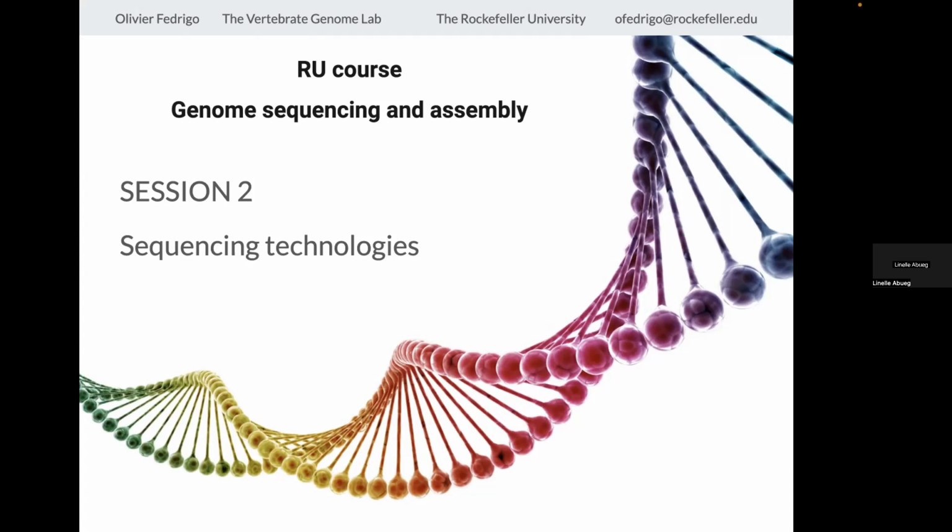Right. So for those online, basically the reason to sequence more is also because every read that you sequence will have some sequencing errors. There is nothing perfect in the world, and so even sequencing reads do contain some errors. If you only have one read from one region, then you will have no way to disentangle the errors from the actual correct bases. But if you have multiple reads that span the same region, then you can use their consensus to reconstruct the correct base in the genome.